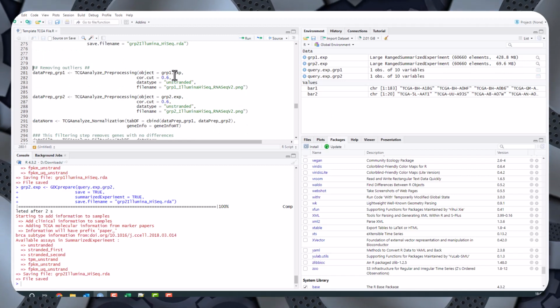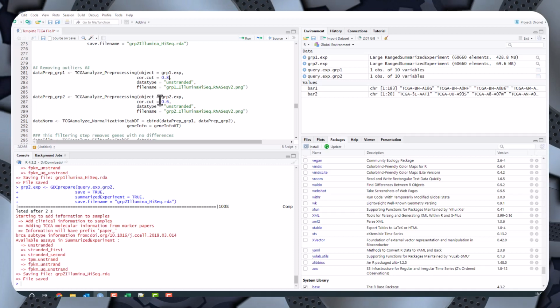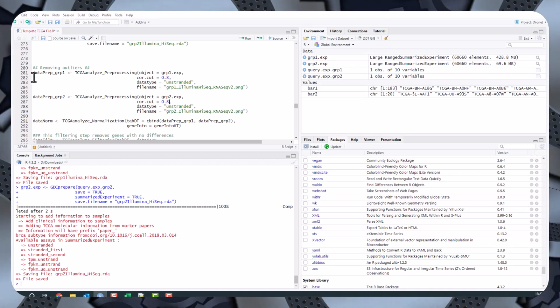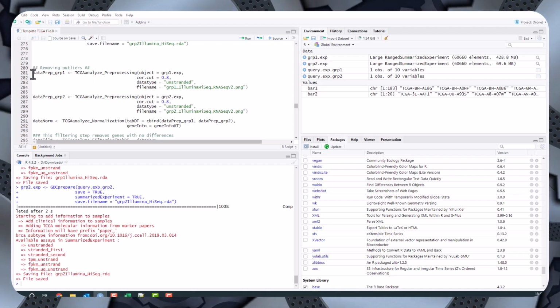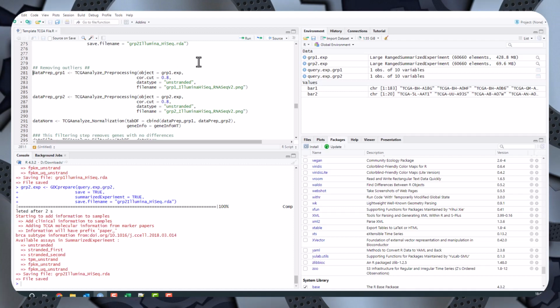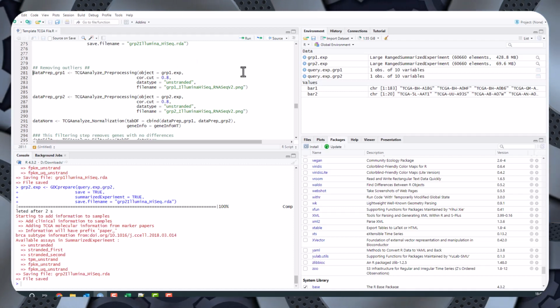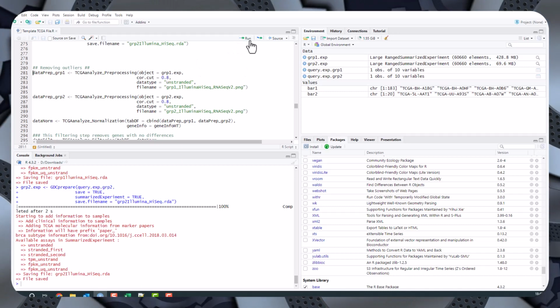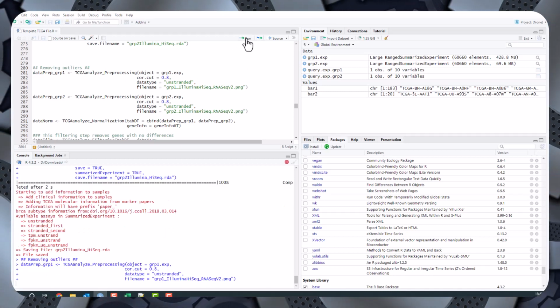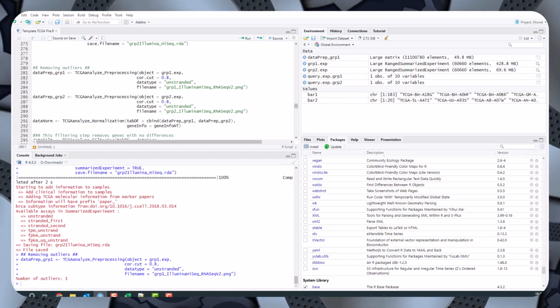Next thing you want to do is remove any outliers. Now I set this to 0.6, actually it's better to set it to 0.8. So what you're doing is you're looking at the data to see if any of the individual patients is very different to any of the others. You're doing this by a correlation analysis, so you're looking at a correlation of 0.8. So I run that one, correlation of 0.8. It detected that there's one outlier.